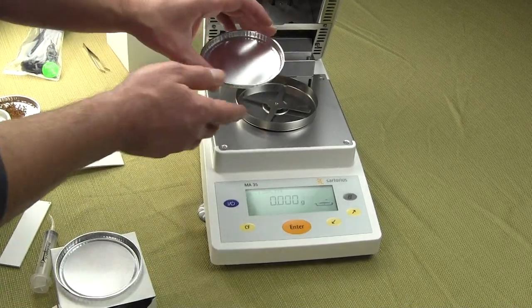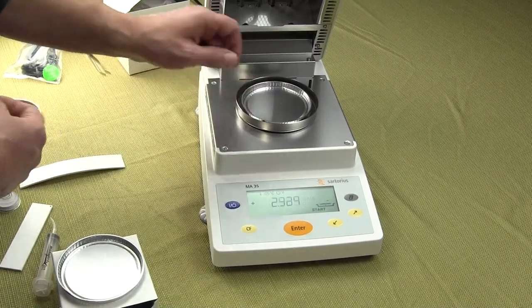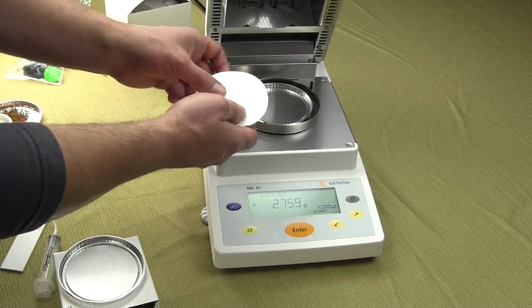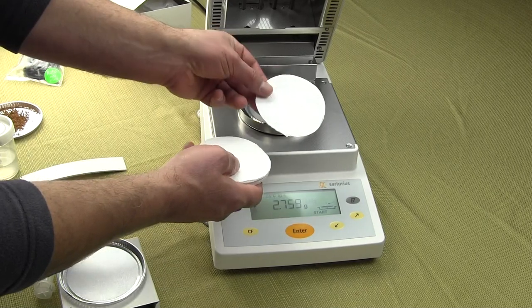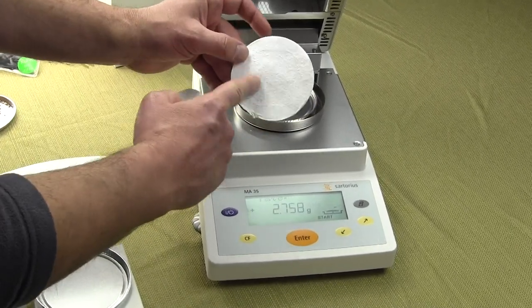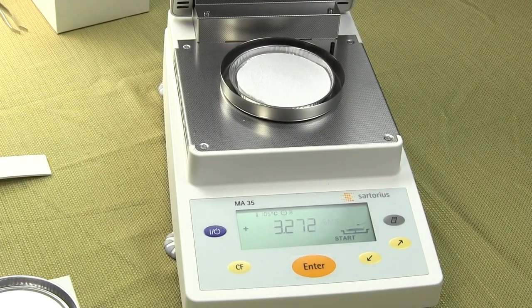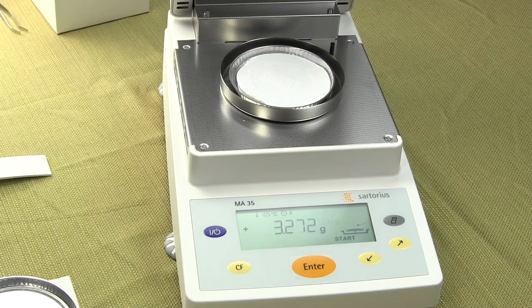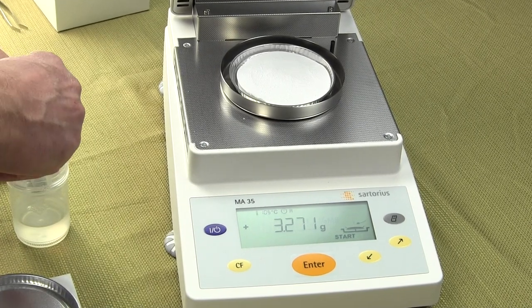The first thing you want to do is put on the aluminum moisture pan. We're going to be using a filter pad. On the filter pad itself there is a smooth side and a rough side. Since we're putting a liquid on here, we'll have the rough side up. With this solution we'll simply take a syringe and spread it on there.